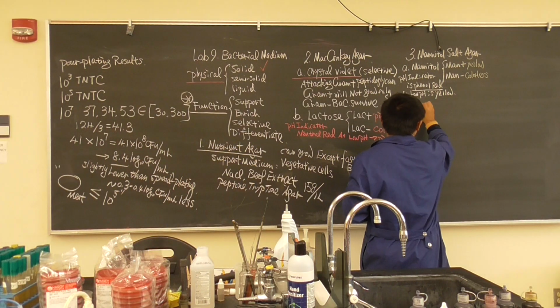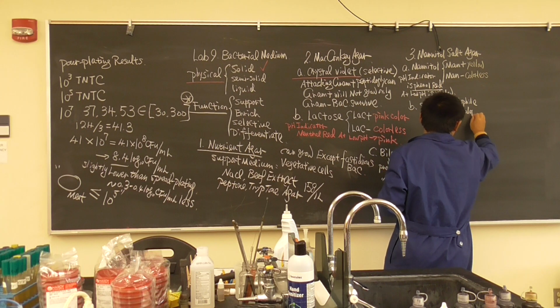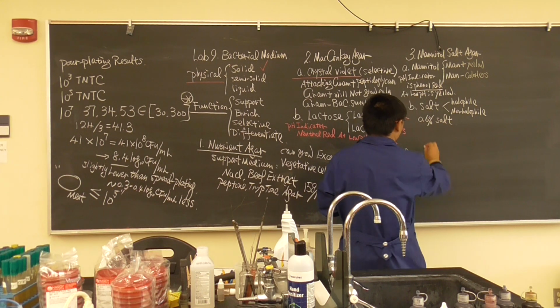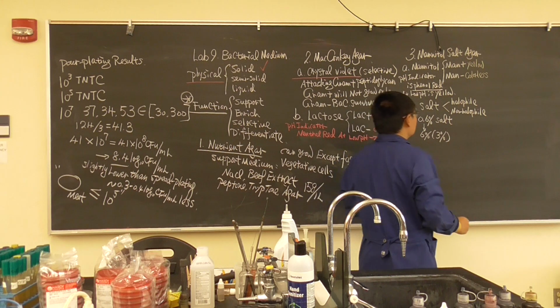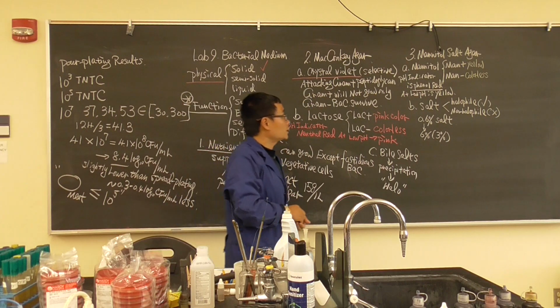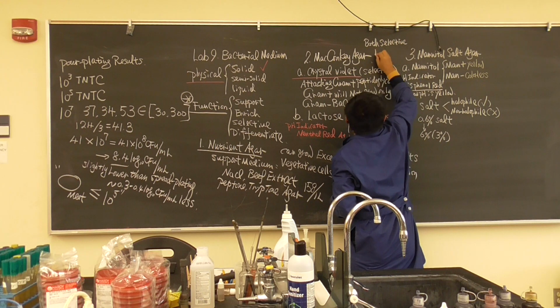Second component is salt. And we mentioned we could separate bacteria as halophiles and non-halophiles. This salt is somewhere around 0.6%. Sometimes it's about 0.6 to like 6% or like 3%. It depends, different combinations. So halophiles will grow, non-halophiles will not grow. So this tells you both MacConkey agar and mannitol salt agar are both selective and differential media.